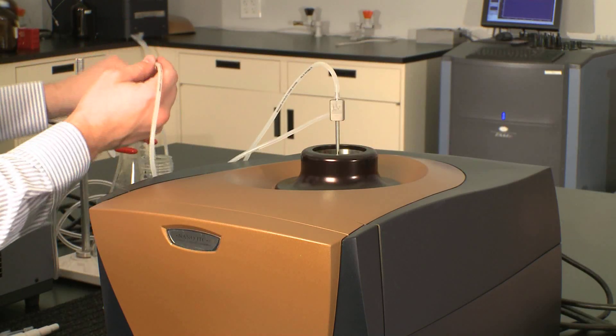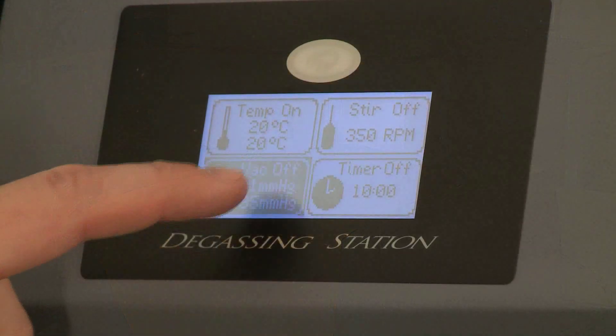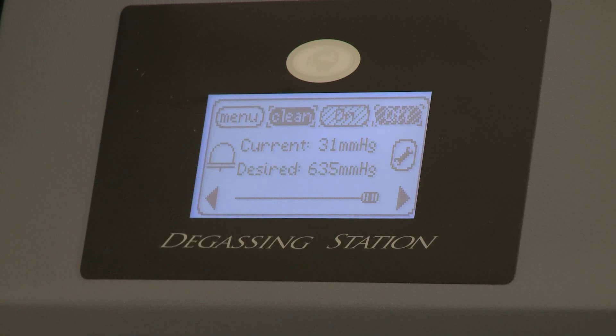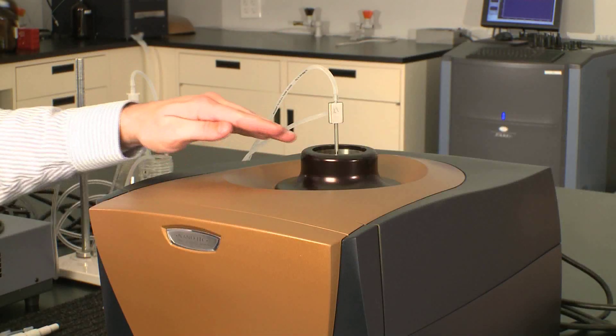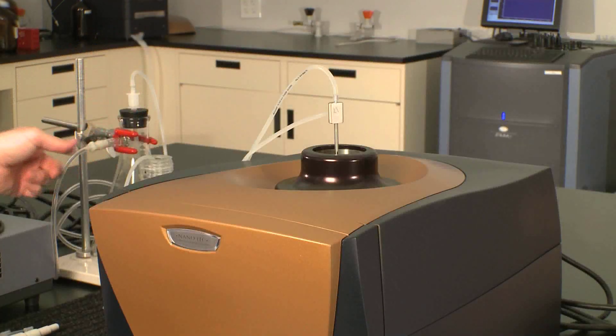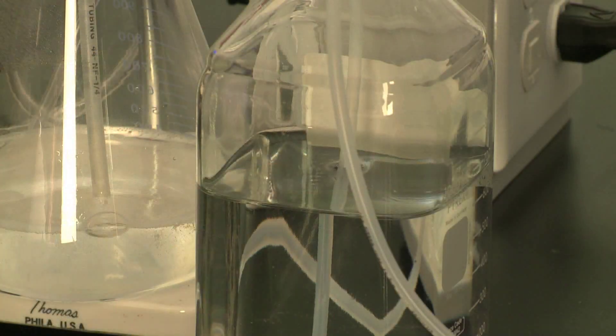Here we're going to be rinsing through about a liter of water. Come over to my degassing station and hit the clean button. You can see that suction was created, and now I'm flushing liquid through my ITC cell.